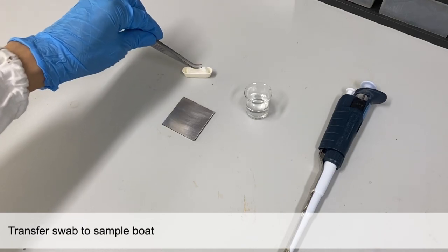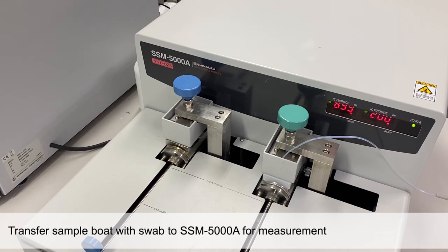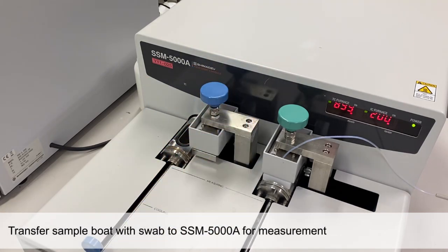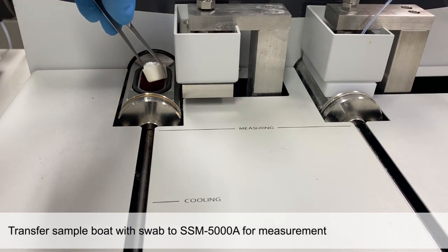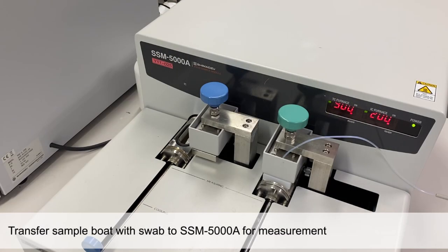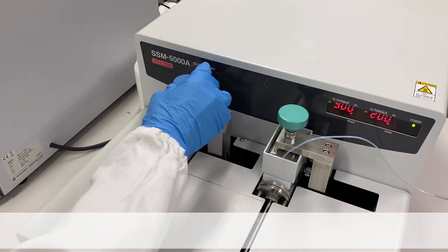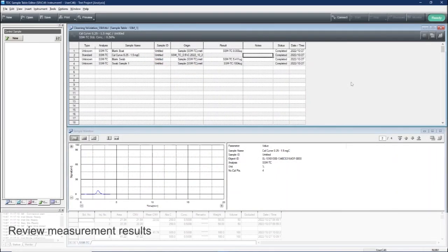Transfer the swab to a sample boat. And lastly, insert the sample boat containing the swab into the SSM-5000A solid sample module and perform the measurement. Once the measurement has been completed, the result of the swab sampling can be viewed directly from the software.